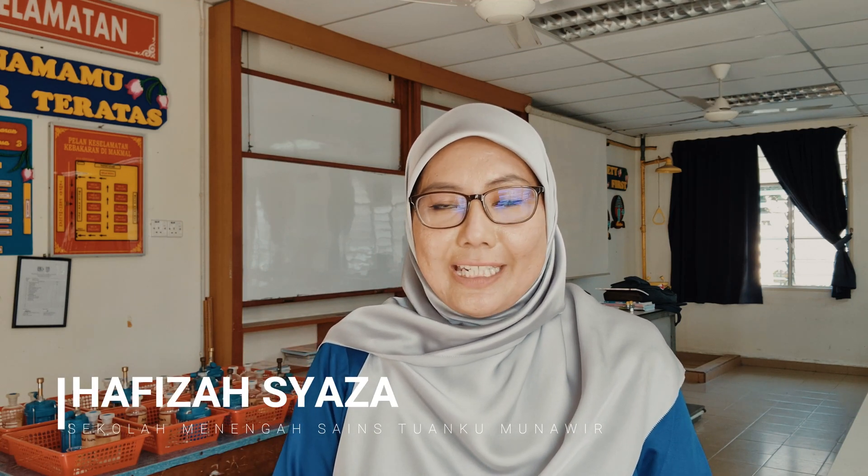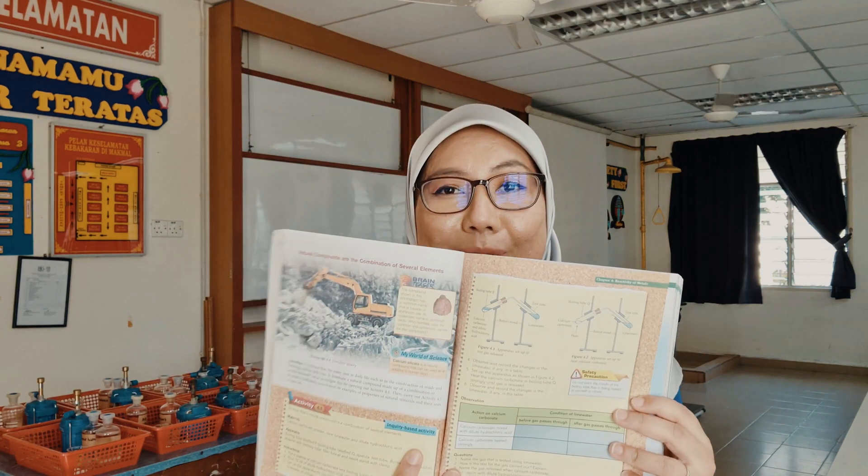Hi, today I'm going to demonstrate Activity 4.1 that you can find on page 126 in the textbook to show that a natural compound is a combination of several elements. Let me show you how to do it.